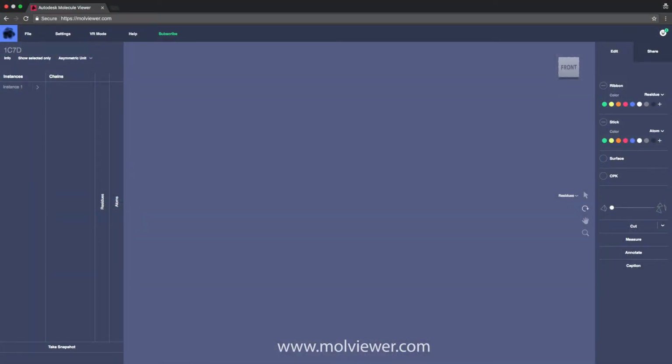So today I'm going to be making an interactive presentation using the Molecule Viewer. I'm going to specifically be using a magnesium channel just as an example. This is a bacterial magnesium channel that regulates magnesium uptake. So what we're going to do is have the viewer open here, and go under File and put in the PDB ID, which in my case is 4I0U.